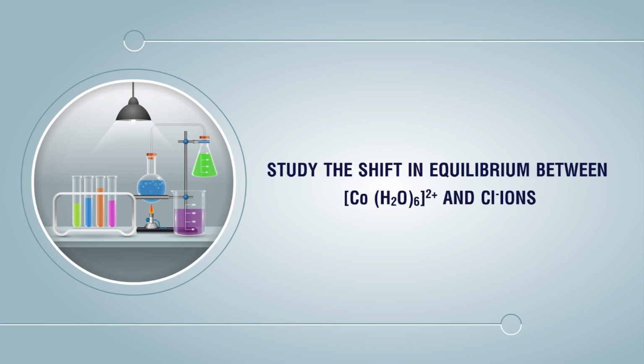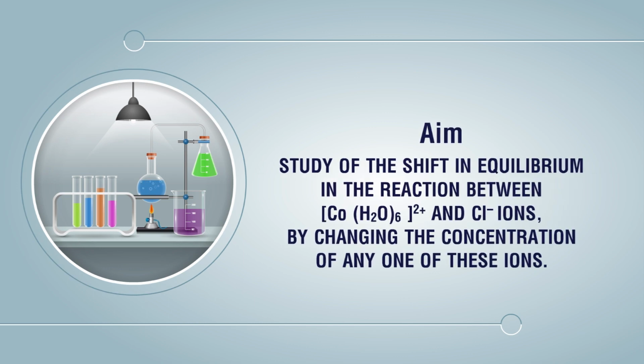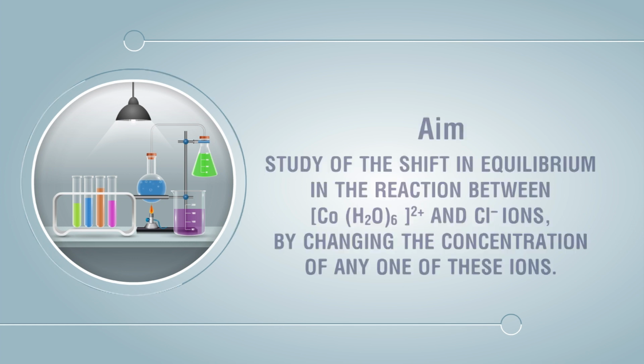Study the shift in equilibrium between Co(H₂O)₆²⁺ and Cl⁻ ions. Aim: study of the shift in equilibrium in the reaction between Co(H₂O)₆²⁺ and Cl⁻ ions by changing the concentration of any one of these ions.